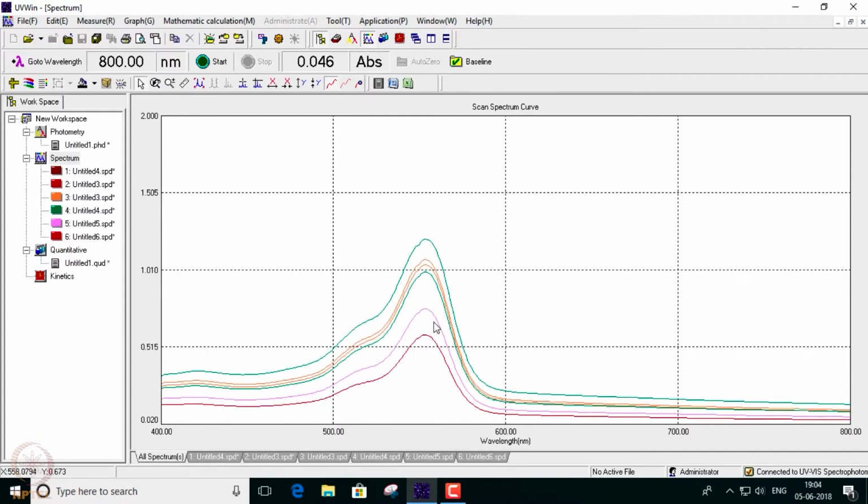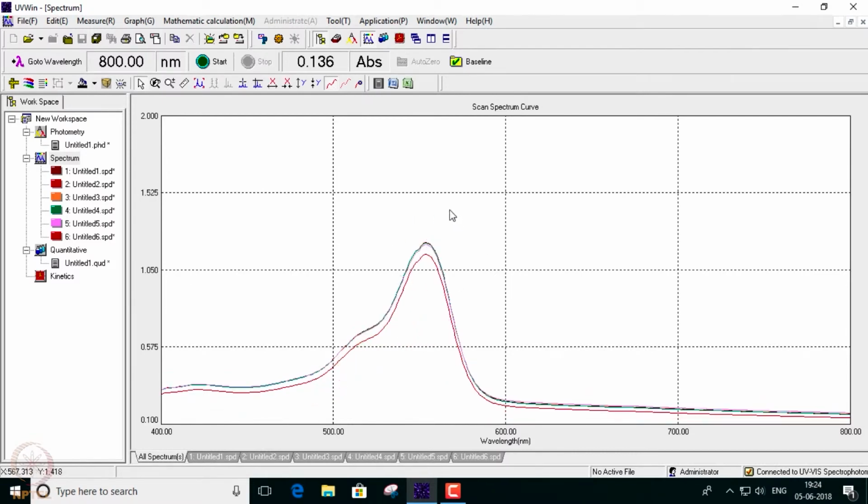Similarly we will show this for the dye kept under dark conditions. From this window we can see that the absorbance of the solution kept in dark has decayed very little over 100 minutes, which can be compared with the solution kept in sunlight, where the absorbance has decayed a lot over 100 minutes. So from this we can see that the dye has really been degraded when kept in sunlight and when TiO2 is added to it as a catalyst.